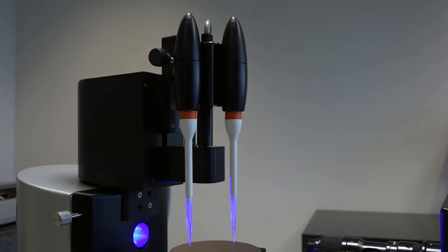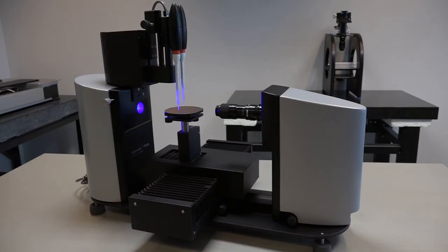With this system, measuring surface free energy or doing contact angle mapping is extremely easy.